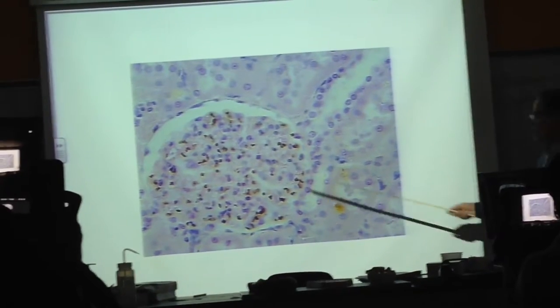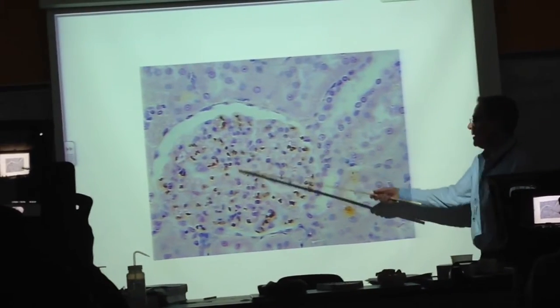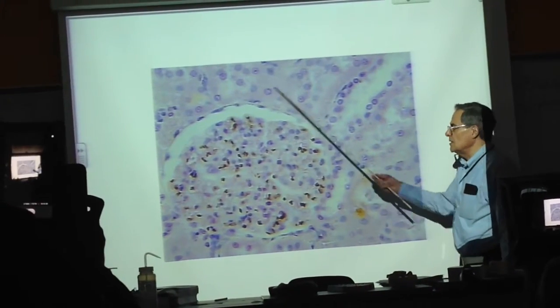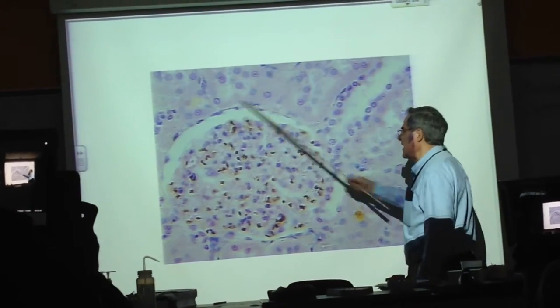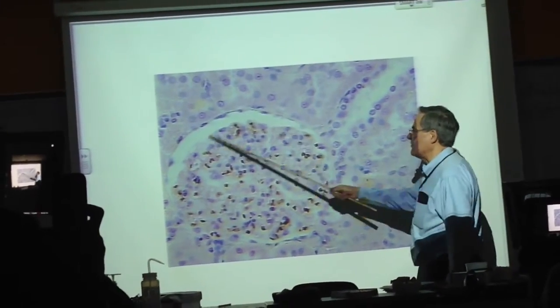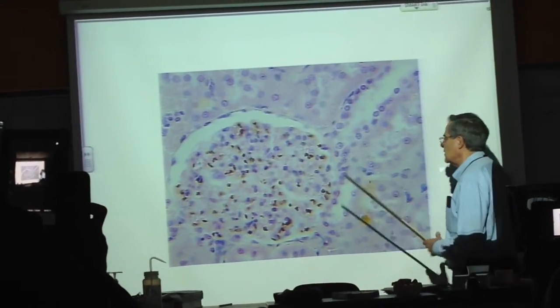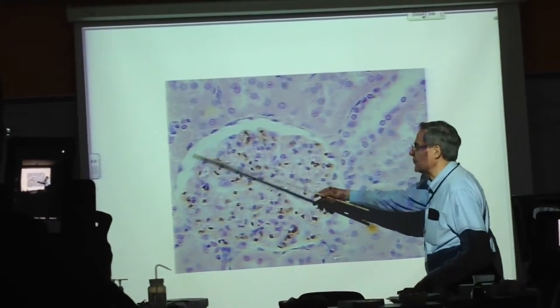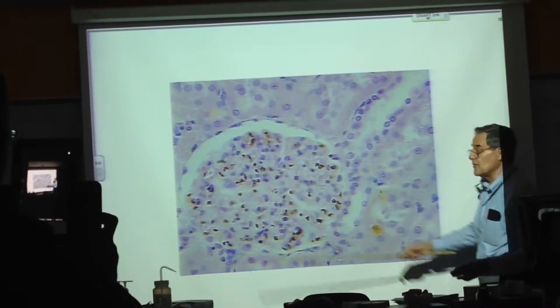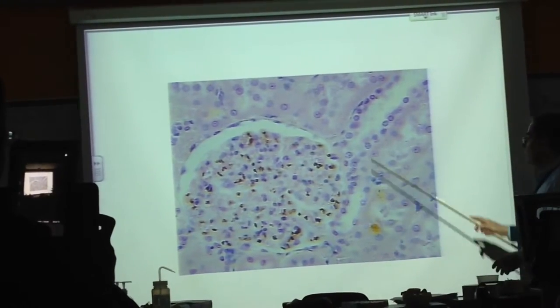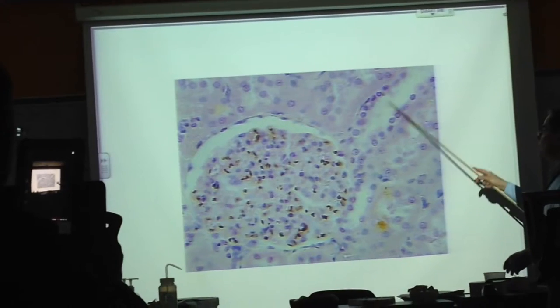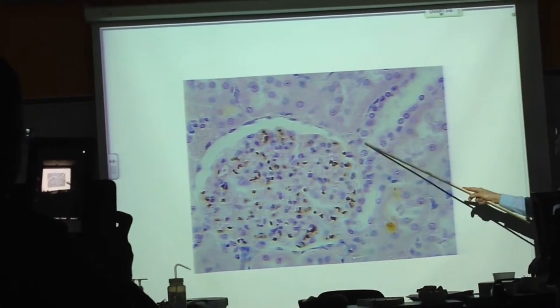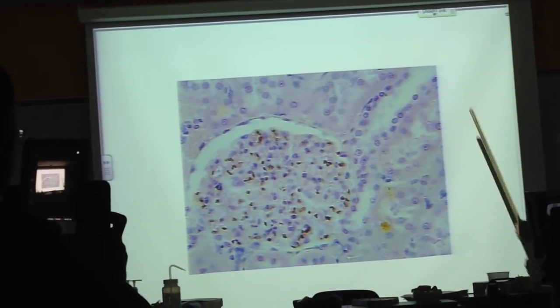Again, this is the glomerular capillaries, this is the Bowman's capsule, here is the cavity of it. Again, it is lined with simple squamous epithelium — you can also see it in the models — and here is the proximal convoluted tubule coming out of the Bowman's capsule.